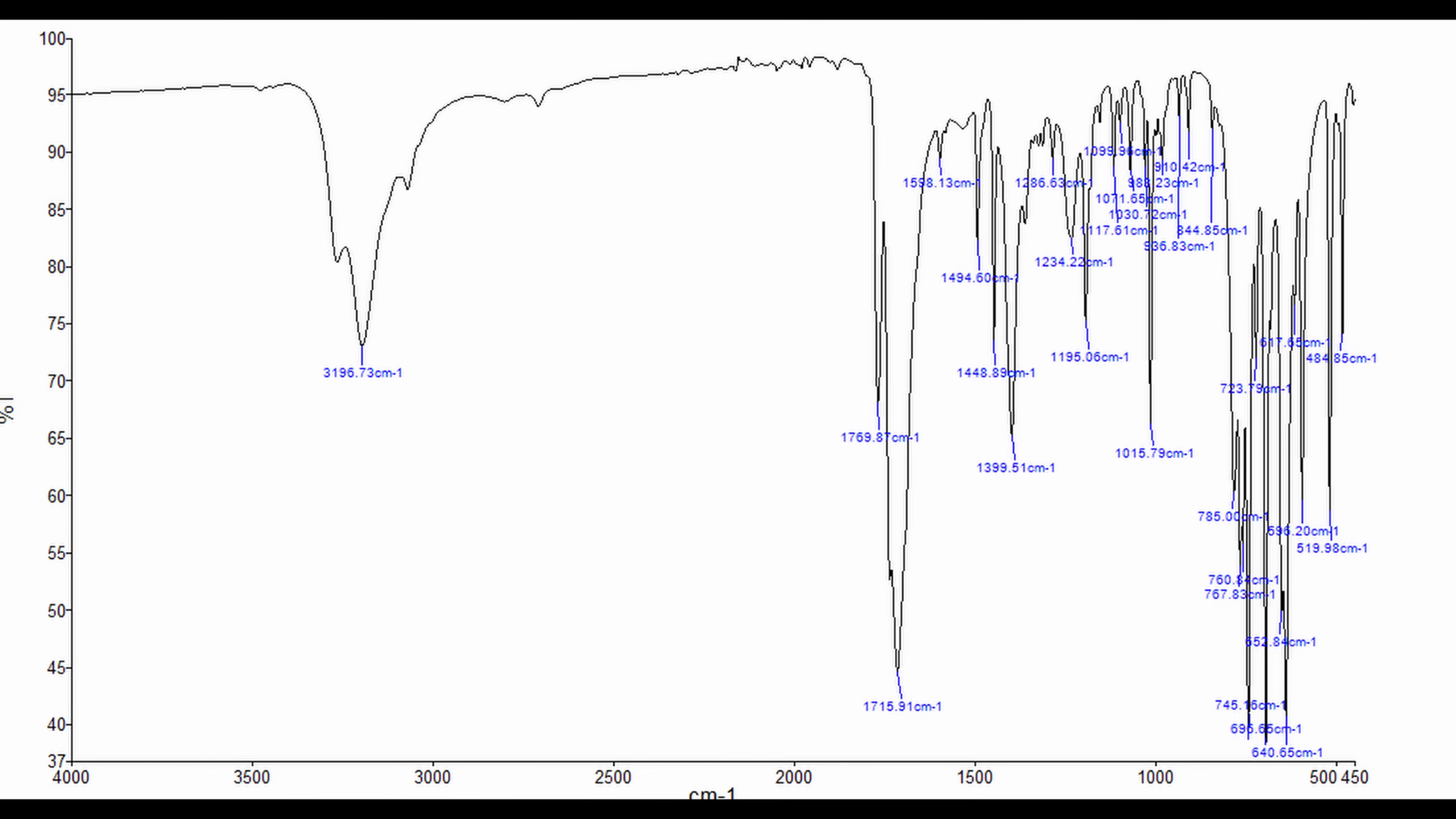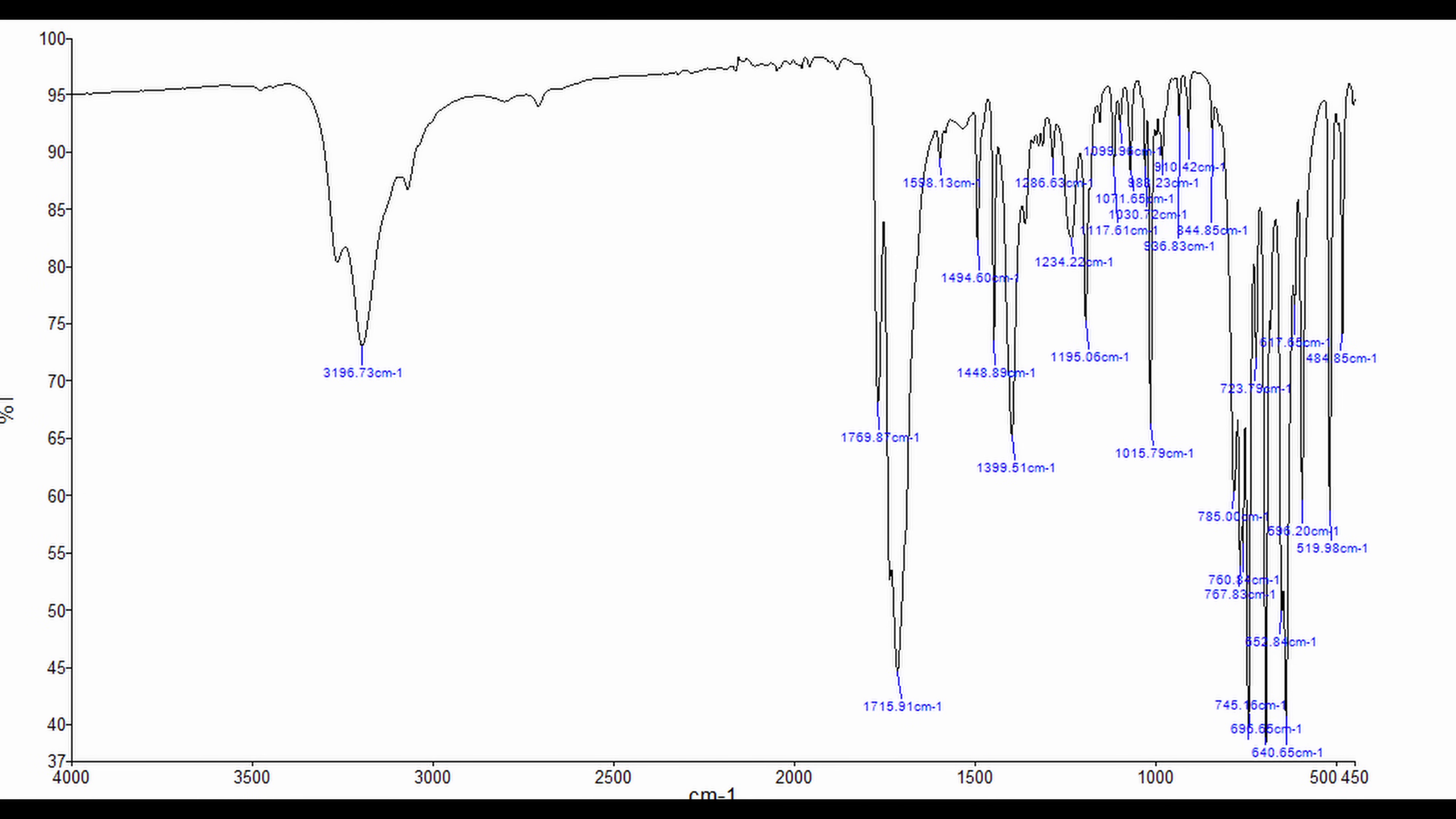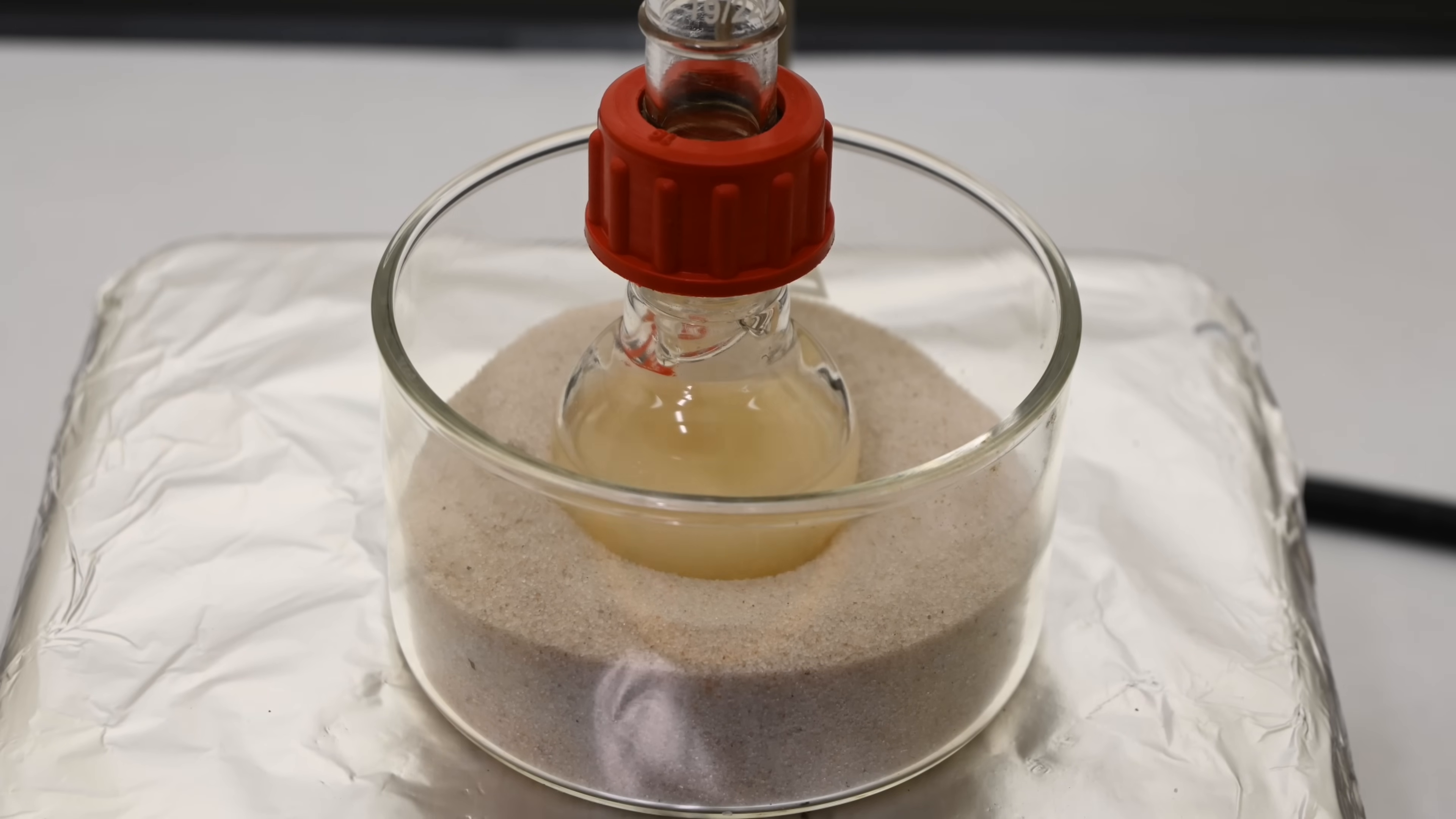The amide 1 band, predominantly associated with the carbonyl stretching vibration, typically appears clearly and strongly near 1700, reflecting the presence of a lactam carbonyl group within the hydantoin ring structure. Additionally, the amide 2 band arising from an N-H bond, produced by coupling of C-N stretching, typically emerges around 1550 to 1500, confirming the successful ring closure and nitrogen incorporation into the ring structure. All this comes together to say that we have successfully synthesized Dilantin.